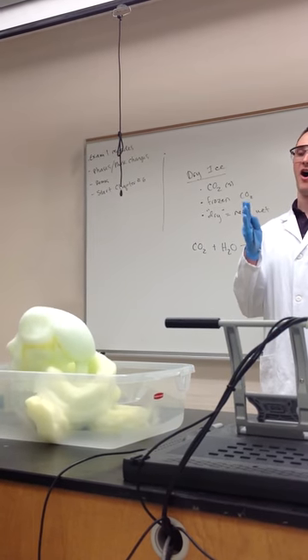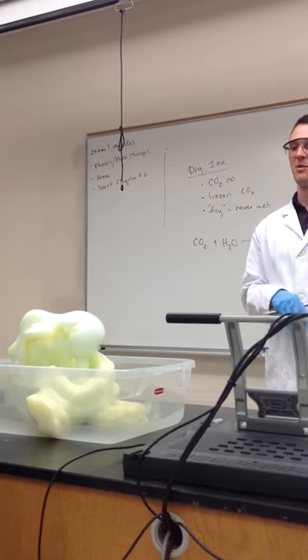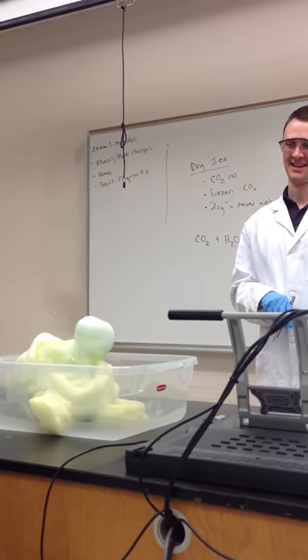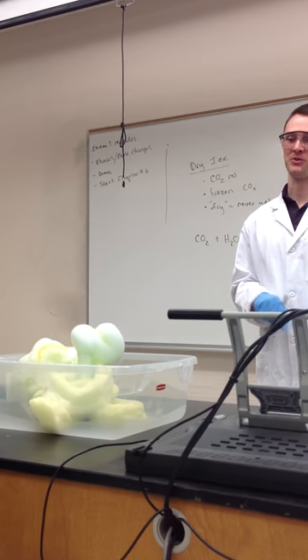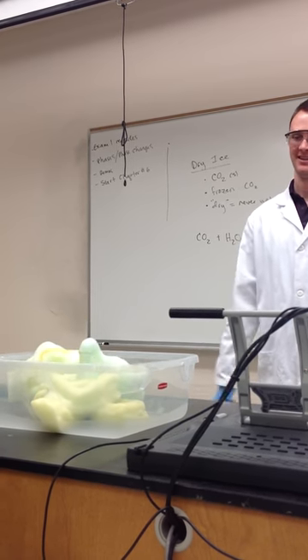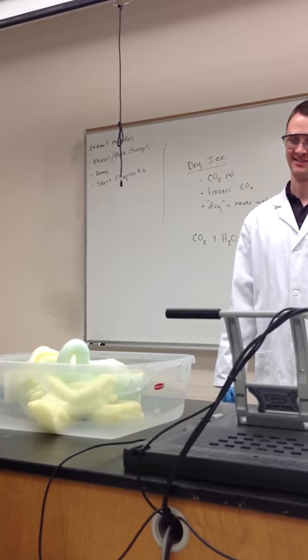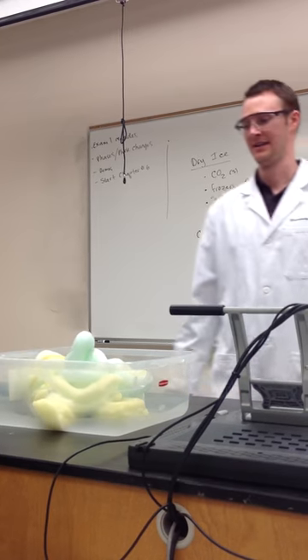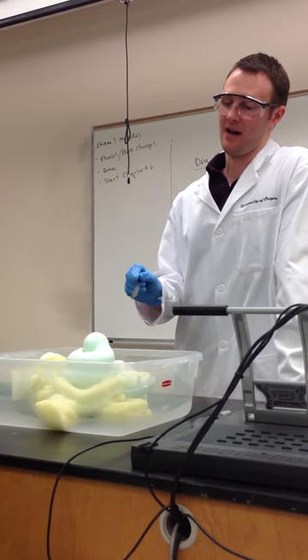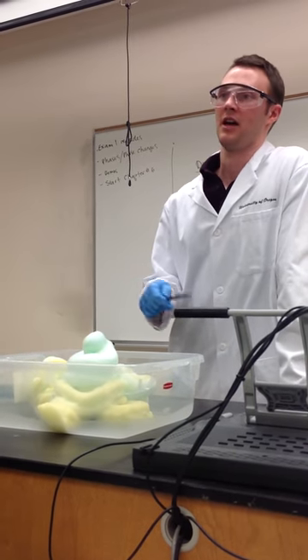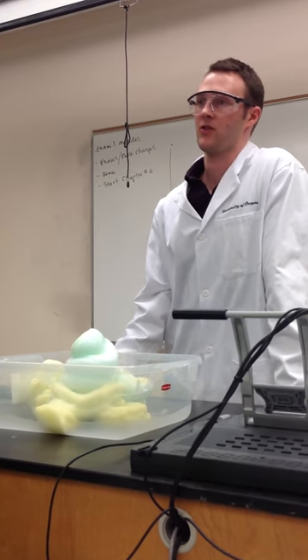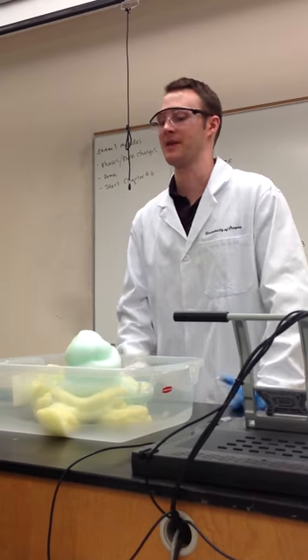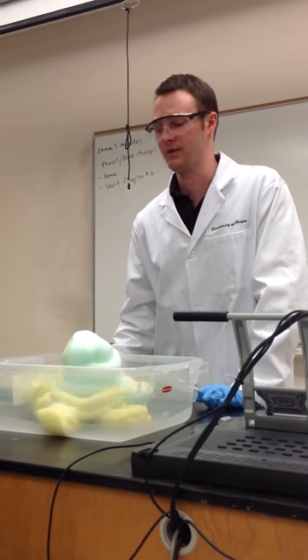So all of these bubbles, most of these bubbles are filled with oxygen, just pure oxygen. And again, I added the soap just so we could kind of see the volume of air that is coming out of this stuff. And the greens just added in a nice little green, a little blue color into it. That's so cute. But all of this stuff, everything that you just saw, was going to happen anyways, just over a much longer period of time. And by adding this catalyst, all I did was I made it happen all right now. Kind of intense.